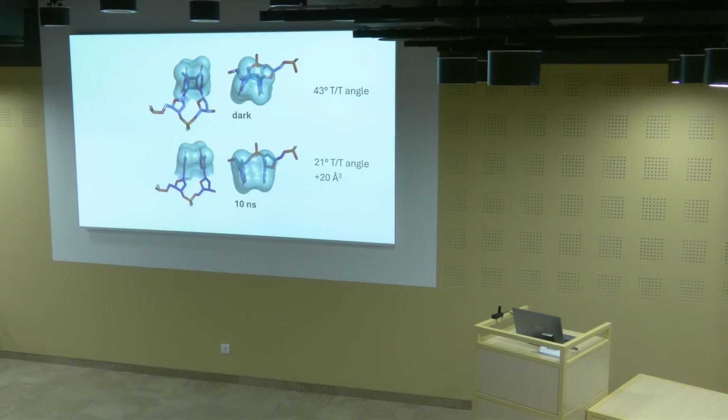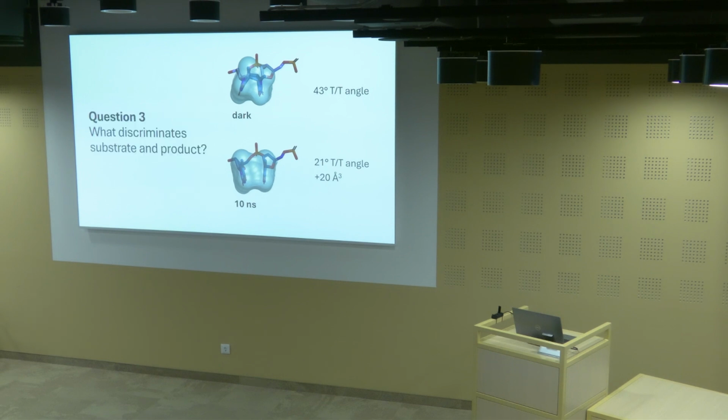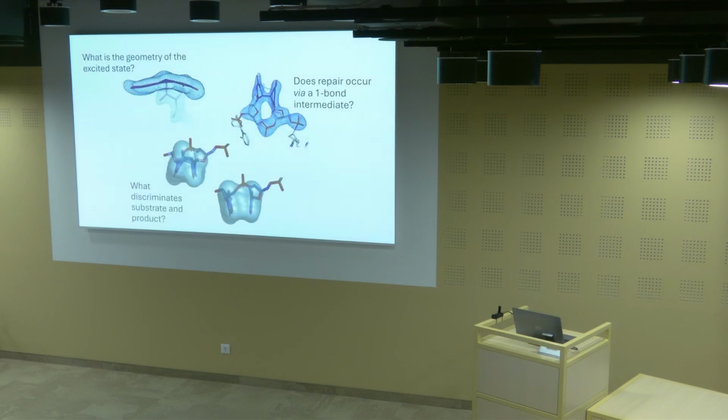But there's not enough room for them in the active site actually. So they basically push against one another and swell the active site pocket. This actually causes the rupture of a few hydrogen bonds. But in some ways, it looks like the strained geometry of these two bases that are pushed too close together is a primary driving force for their ejection. And the change is actually in the DNA, I should say, not the protein, that clearly drives this product release, which to me was a surprise.